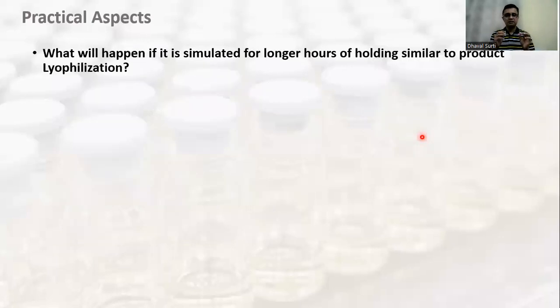Now coming to the practical aspect, what will happen if it is simulated for longer hours of holding, similar to the product in lyophilization? What will happen if we simulate it for a long time as per the product? For example, 40 hours, 50 hours, 60 hours. I have seen cycles up to 96 hours.